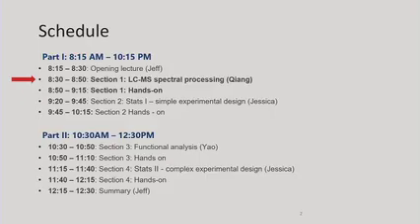Now this is the first session for today's workshop. In this section, we are going to cover LC-MS spectral processing. I will give some lectures on the basics, from something very basic to a deeper understanding of the raw data processing, as well as some demo. Then I will give you around 20 to 25 minutes for hands-on. You can practice according to my demo to see if you experience any problems. So this is section 1.